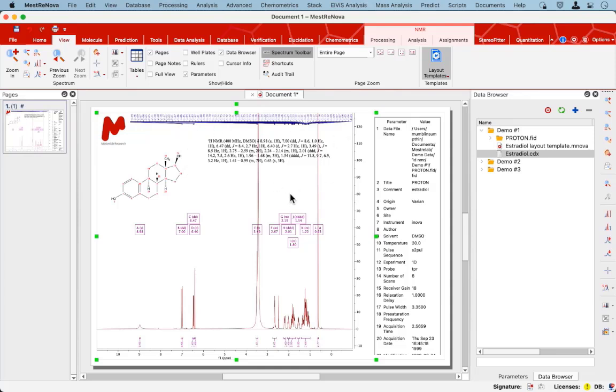The spectrum has been pushed over to the left so that we can put the parameter table in automatically, and also a little logo has been added to the top left hand corner.